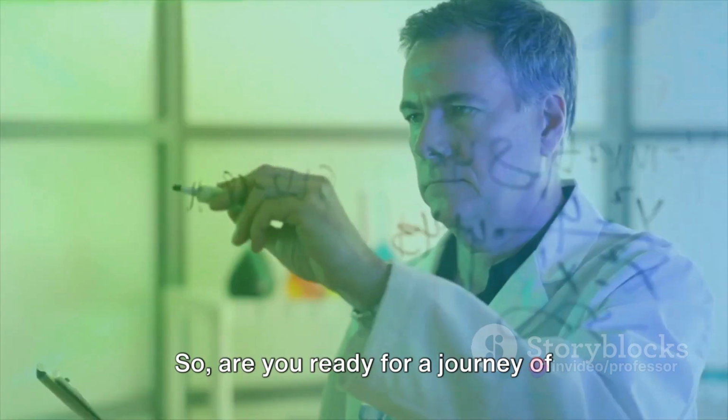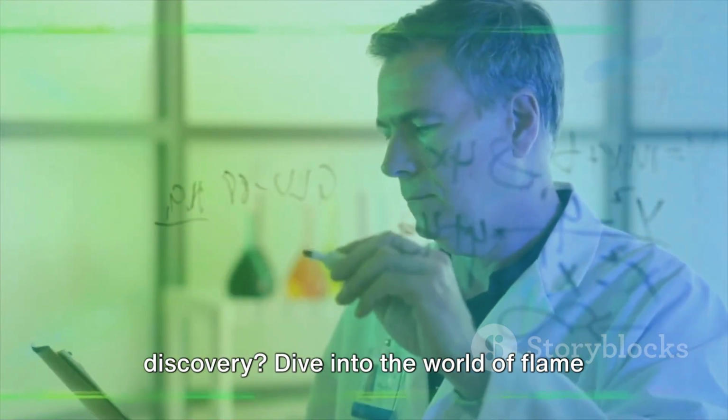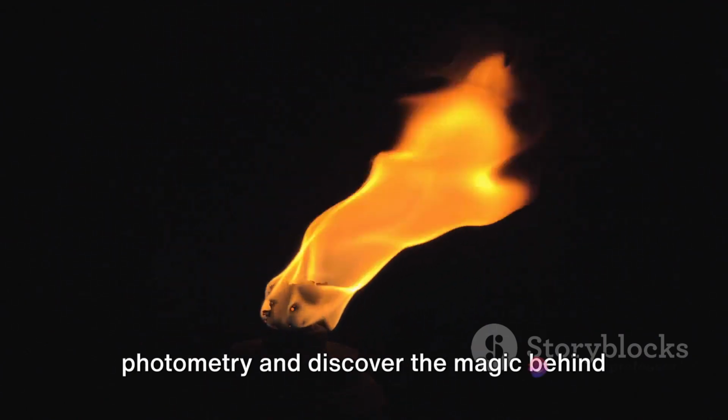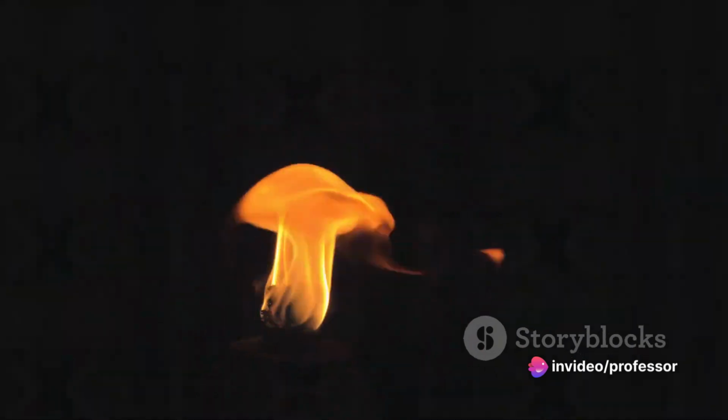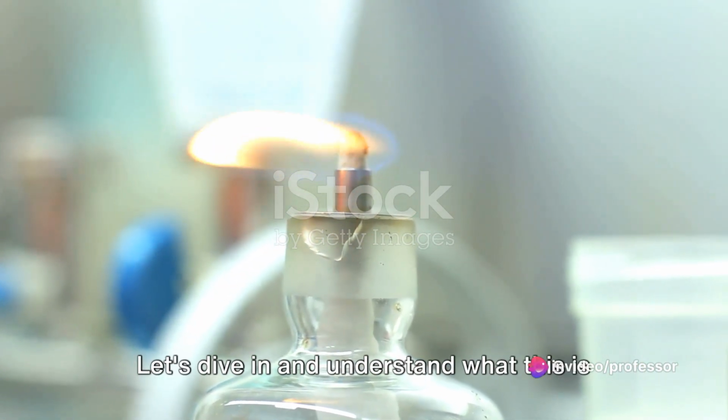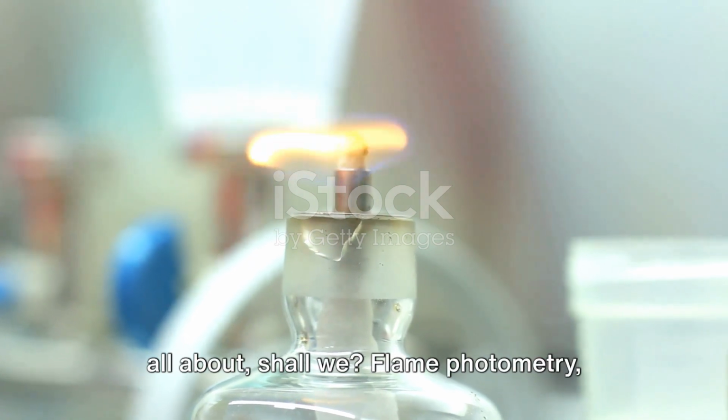So, are you ready for a journey of discovery? Dive into the world of flame photometry and discover the magic behind this incredible instrument. The principle of flame photometry is as fascinating as it sounds. Let's dive in and understand what this is all about, shall we?